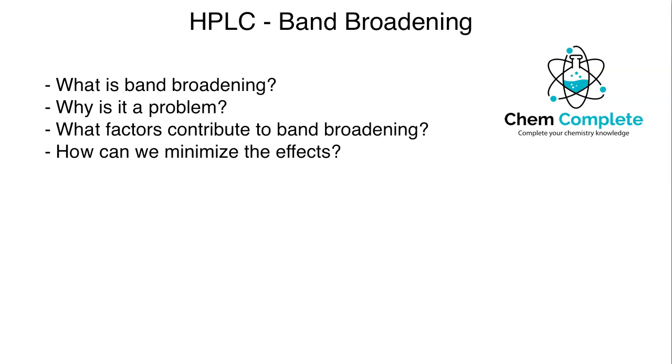Hello everybody, welcome to another Chem Complete episode, and what I would like to address today is an add-on to the HPLC series. If you've been following the series, you know we've been going over some of the major methods for HPLC, such as normal phase, reverse phase, ion, and we've also discussed in great detail column chemistry, as well as the basics of HPLC and HPLC instrumentation.